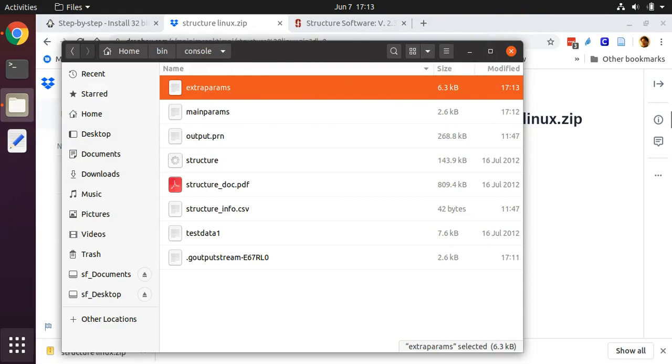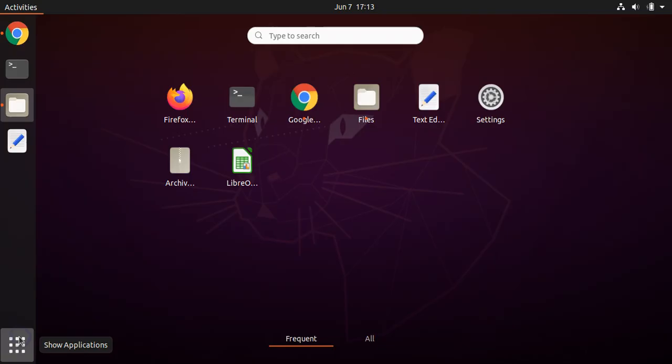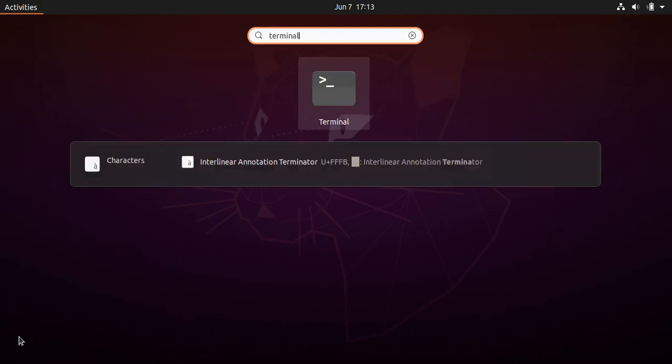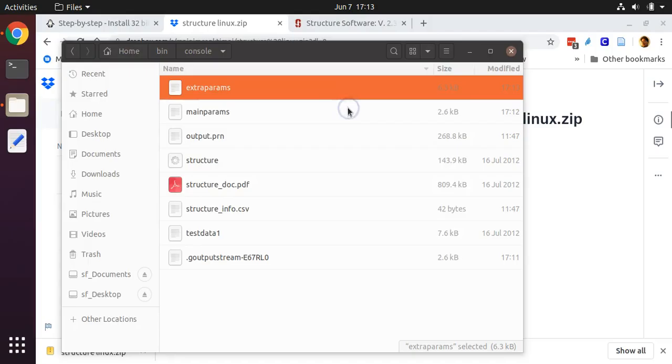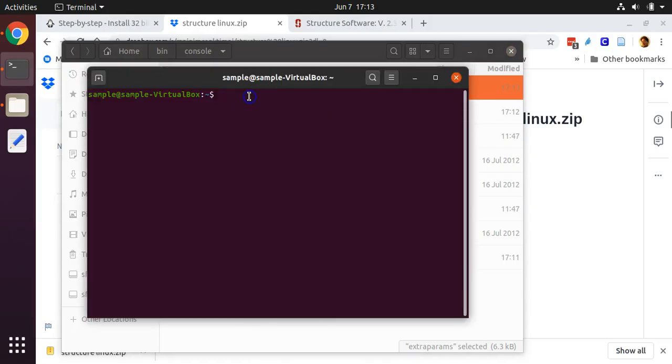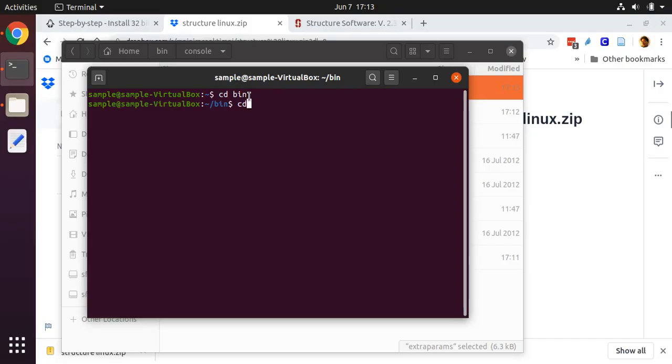Now we are ready to run STRUCTURE. Open up a fresh copy of terminal. We need to navigate to the folder that includes STRUCTURE, as well as our sample data. Make sure that your data is included within the folder where you have the STRUCTURE program. It's possible to have the data in a different folder, but it makes running it from the command line more difficult. In our case, we're going to go to the bin folder from our home directory, and then we're going to go to that folder called console, which is where the STRUCTURE program, as well as our sample data, is located.